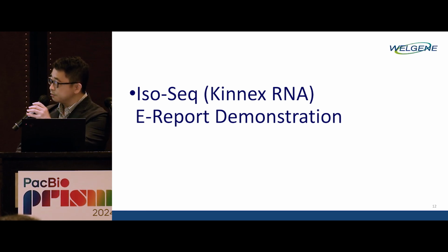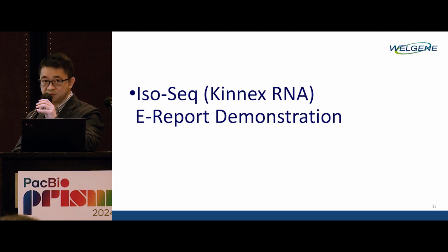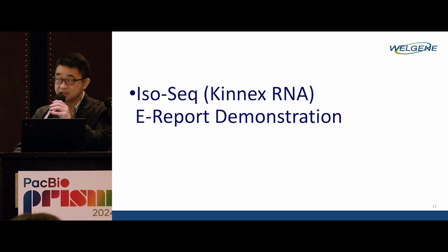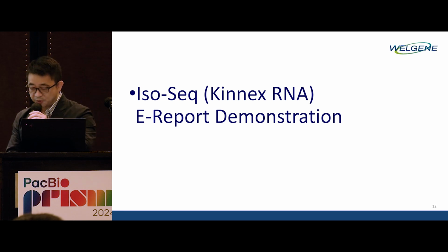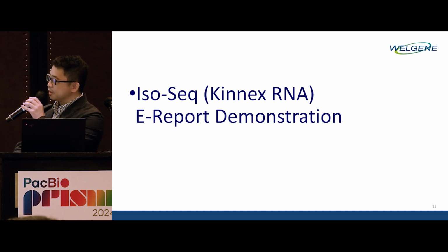The next part is gene fusion analysis. You can choose which sample you are interested in. For example, if I'm interested in a gene function, you can click the keyword and type the gene here. Then you can find the gene you are interested in. If I'm interested in this gene fusion, I click here and I find fusion 2. I click here. Now the bottom table has changed.